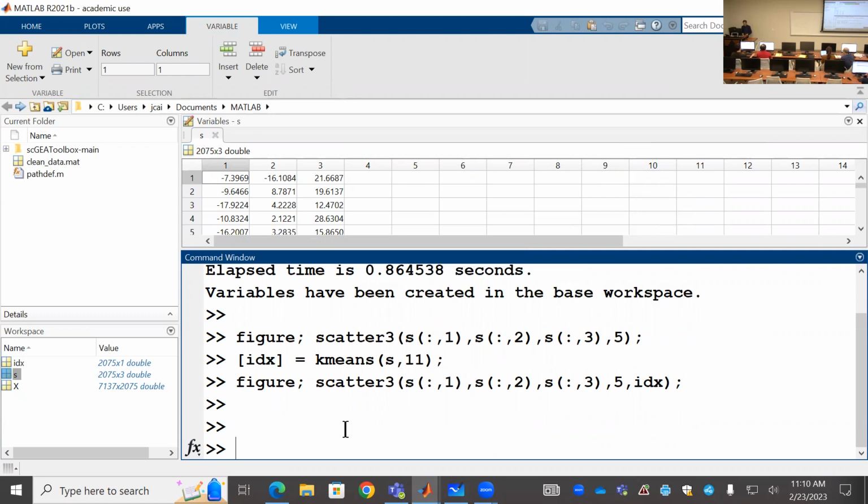So I'm going to do some normalization transformation. Let's see, norm. The reason I want to do this is because internally the k-means computes the distance between cells. The distance we use is Euclidean distance.